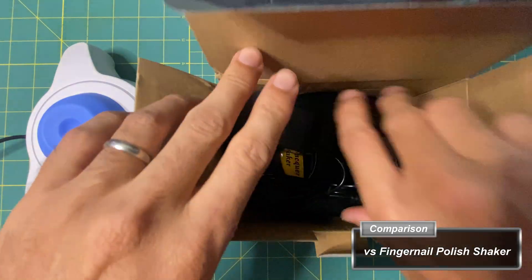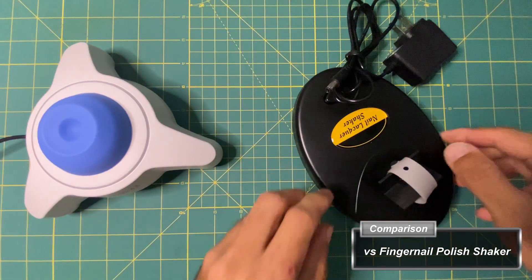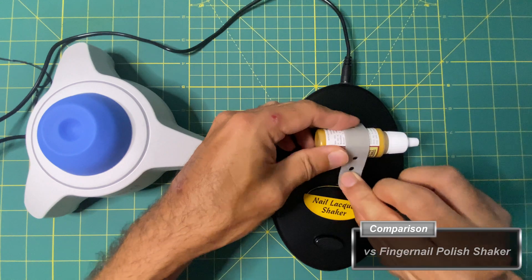Now for a side-by-side comparison to a very inexpensive fingernail polish shaker that I was using previously.